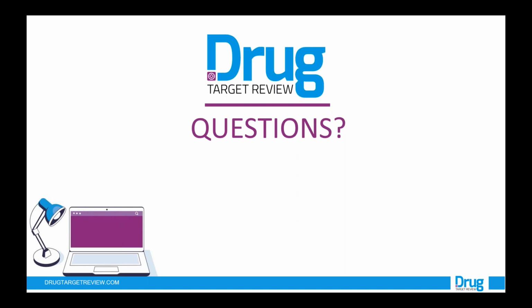Great, thanks. So back to Lester now. Do you ever see multiphasic melt curves, and how do you handle these? What do these mean? Yes, we do see them. I've shown you that we've applied the InCELL Pulse to other targets, and so we have seen them. Interpreting them, I would say, is difficult. Is it compound induced, or is it the protein itself that's multiphasic?